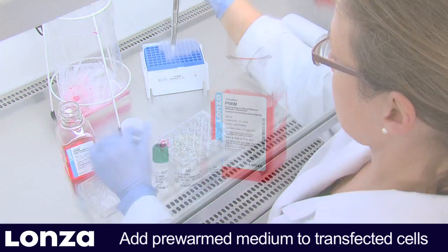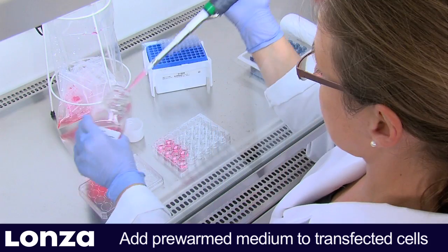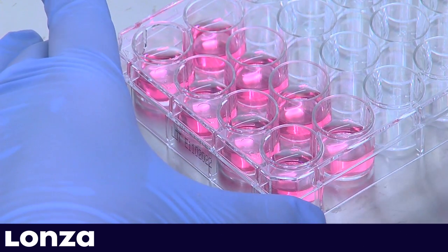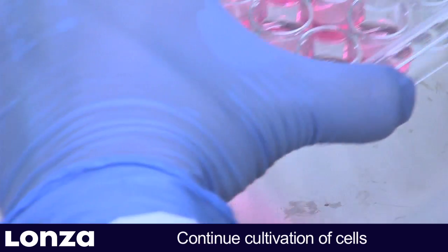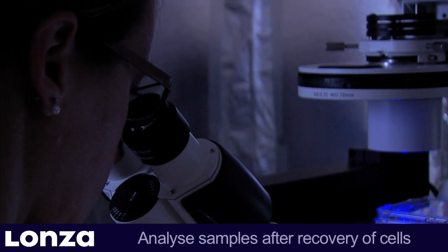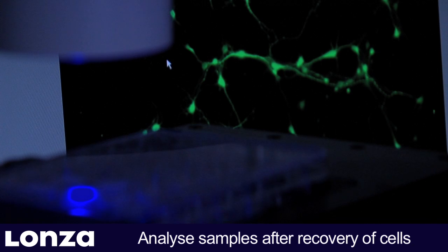For cultivation of neurons, we recommend using the supplemented PNBM medium from Lonza, which has been optimized for neuronal cultures. Now place the culture plate into the incubator and continue cultivation. Before analyzing the transfected neurons, allow the cells to recover for at least 24 hours.